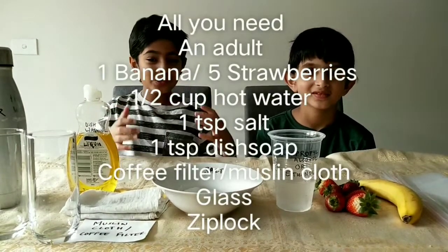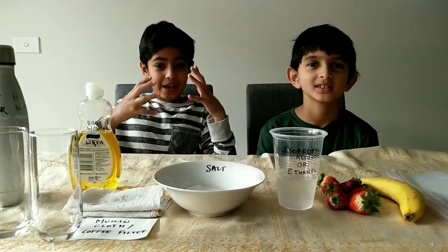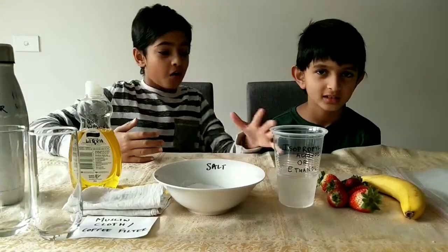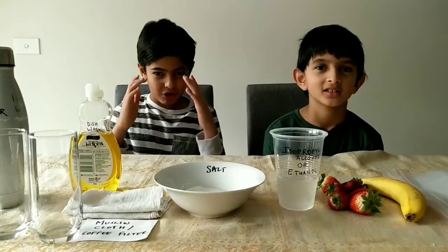Hey everybody and welcome back to Science Thrills. My name is Avik and this is my younger brother Anoush. Today we're going to be extracting DNA from bananas and strawberries. Sounds fancy right? It's actually really simple.